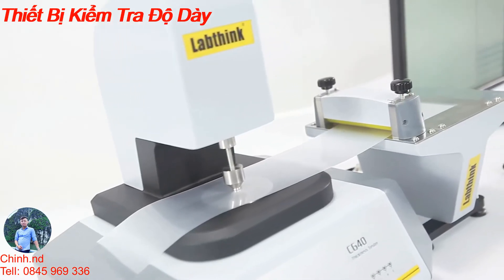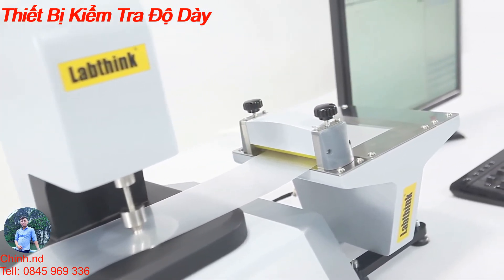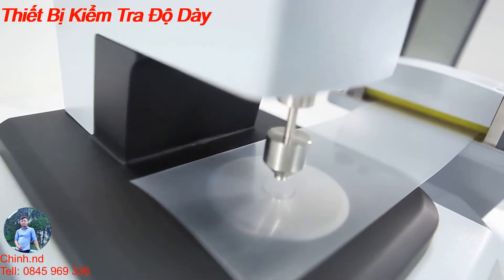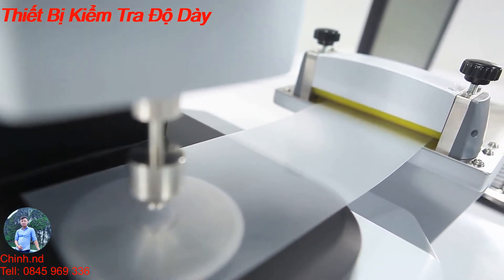The auto sampling function is optional. Feeding space, feeding speed, and measurement points can be set as required, which ensures the accuracy of multiple successive points measurement.